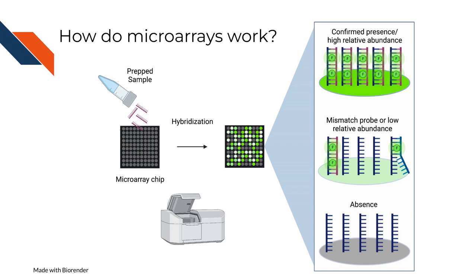Microarrays are a fast and cost-effective way to survey the whole genome at once. Although they are less commonly used since the rise of lower-cost whole genome sequencing, they may still be a suitable choice for your genomic study. There are multiple types of microarrays, but they all involve hybridizing sample fragments to a chip with fluorescently labeled probes. The amount of fluorescence is determined by analyzing an image taken of the chip.